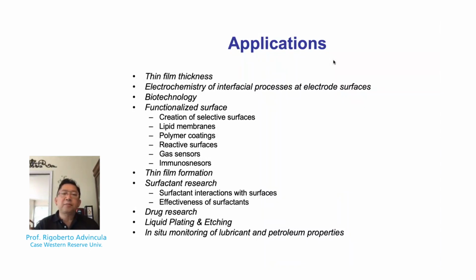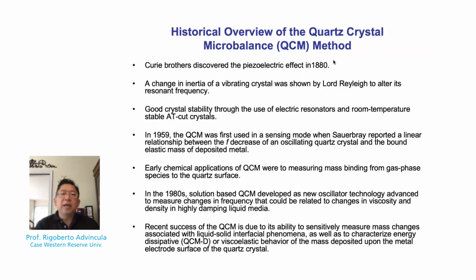So, just a historical overview, QCM traces its origin to the piezoelectric effect, where the relationship of a vibrating crystal can be related to resonant frequency.